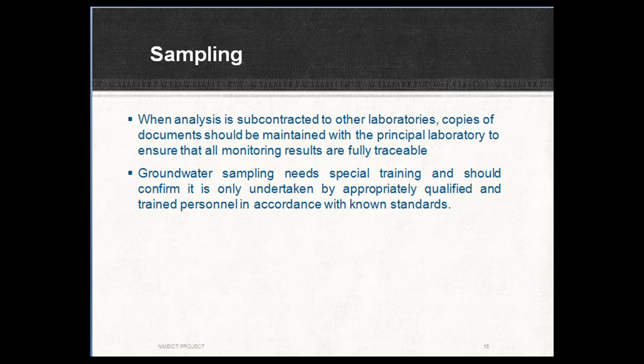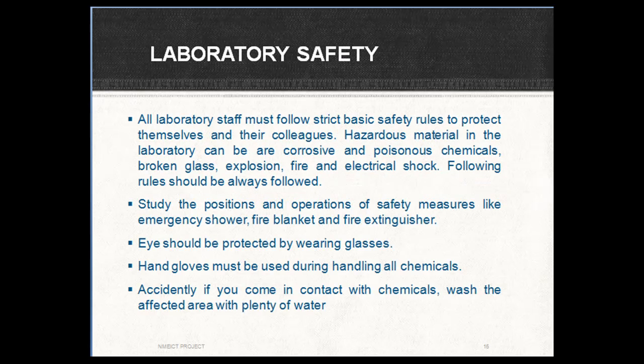Now let's try to understand the laboratory safety. All laboratory staff must follow the strict basic safety rules to protect themselves and the staff. Studying the position and operation of the safety measures like emergency shower, fire blanket and fire extinguishers is important. Eyes should be protected by wearing glasses. Hand gloves must be used when handling all chemicals. Accidentally, if you come in contact with the chemicals, wash the affected area with plenty of water.